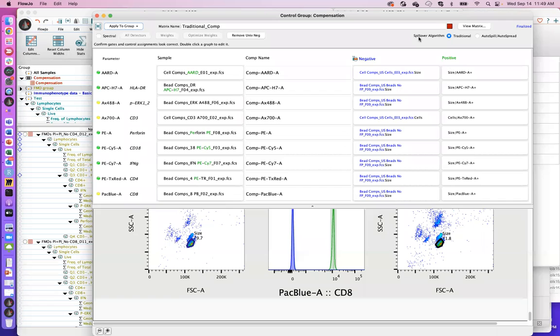Okay, so it uses linear regression, and therefore it likes to see spread in the data. So this particular method is particularly useful when you use cells as your compensation controls. So for this guy, the setup is actually much simpler than the traditional or conventional compensation mechanism.